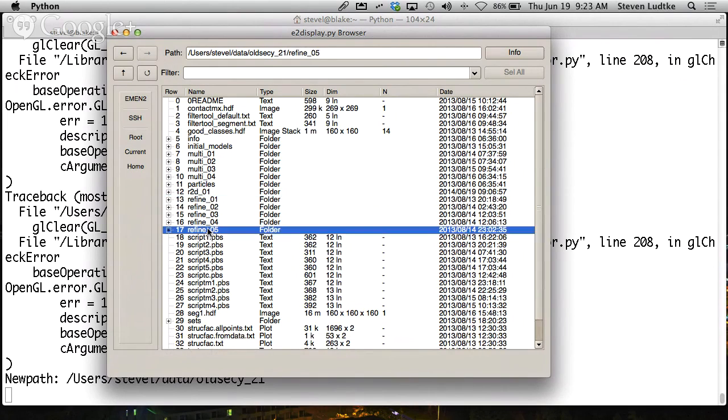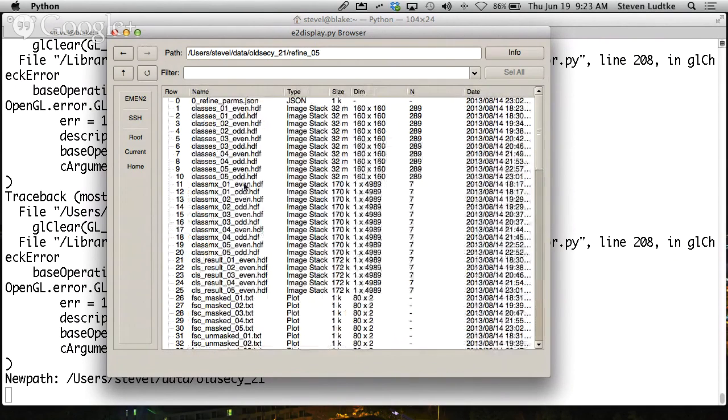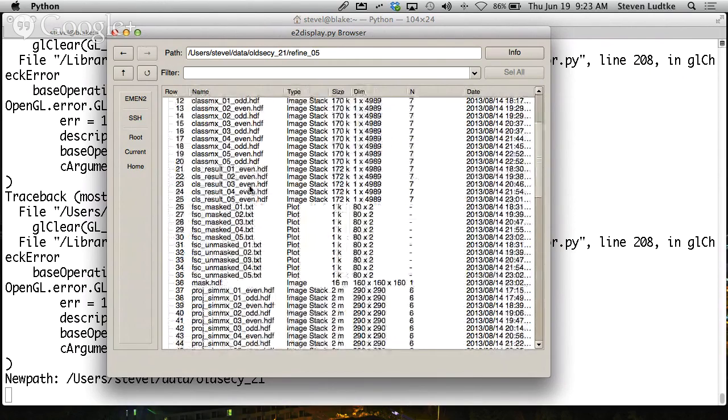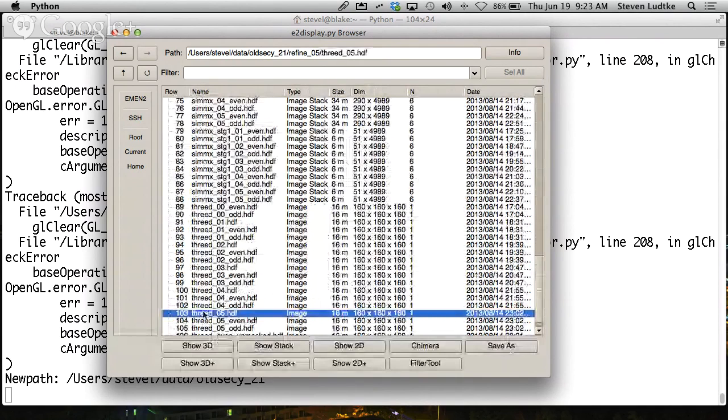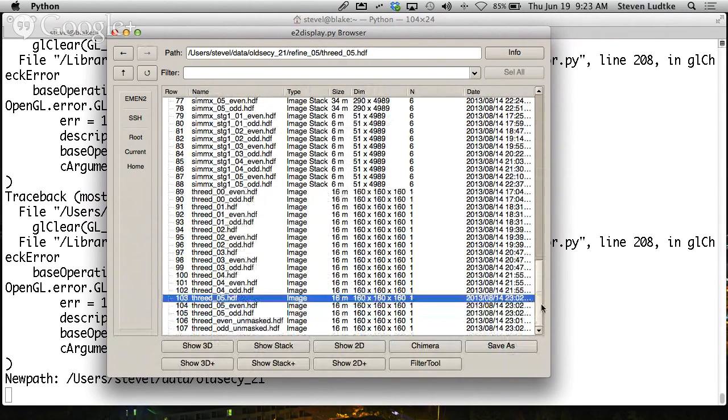So we again looked at one of these previously, but let's look at the files in a little more detail now. As we discussed previously, the final output of the process is, of course, these 3D files. 3D05, for example, being after 5 iterations of refinement, that's the final average between the even and the odd structures. Now, in EMAN 2.1, we use the gold standard refinement processing.